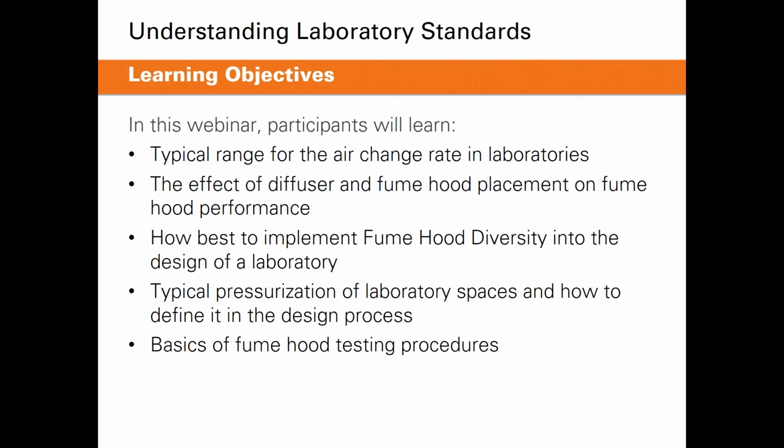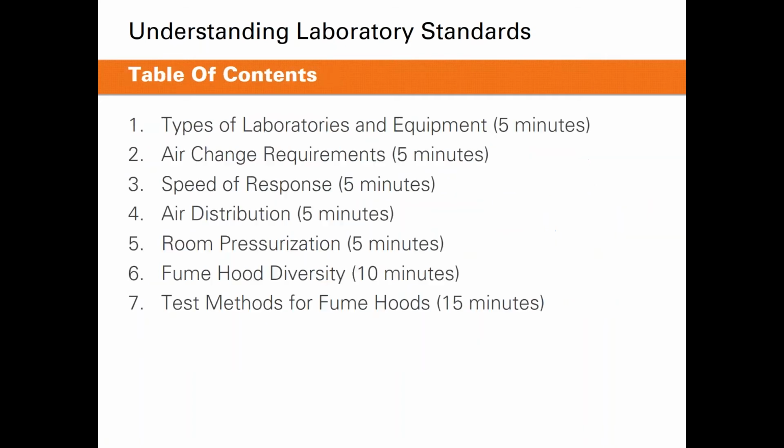In addition, you will learn the typical range for the air change rate in laboratories, the effect of diffuser and fume hood placement on fume hood performance, how best to implement fume hood diversity into the design of the laboratory, typical pressurization of laboratory spaces and how to define it in the design process, and the basics of fume hood testing procedures. I will now pass the presentation over to Michael.